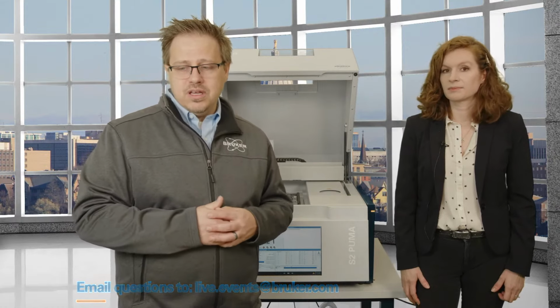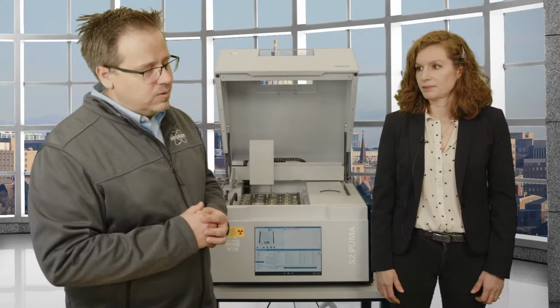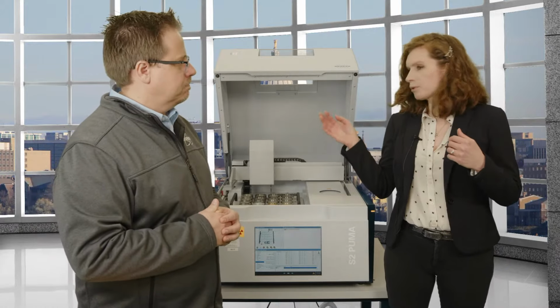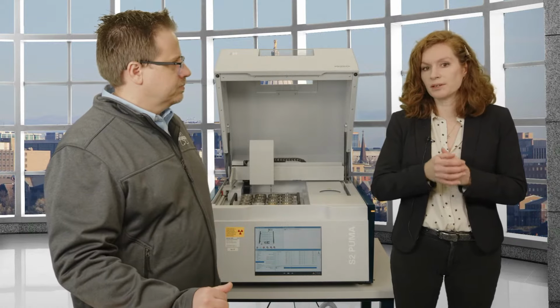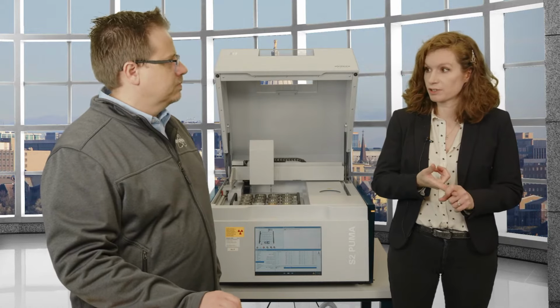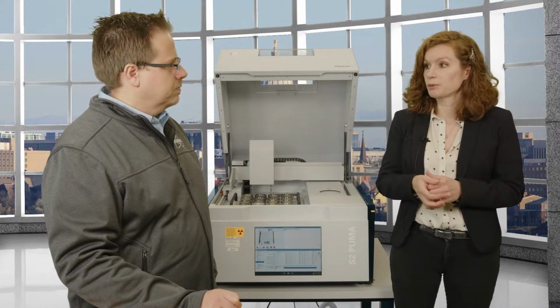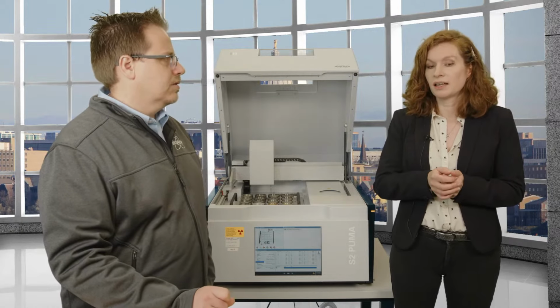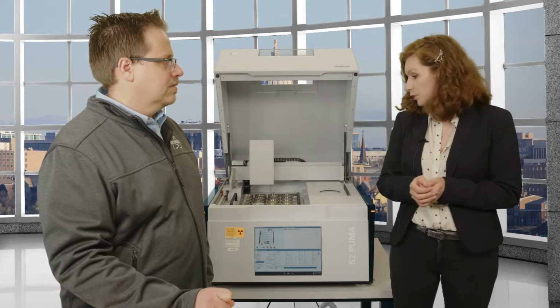The first question that has come in is from Mia: what is the elemental range? Particularly, what about light elements? The elemental range is sodium up to americium, or sodium up to uranium. For the light elements, I would always recommend going with the WD system because that's where you have higher power and can have the right crystals. You can go to fluorine, and you can even see carbon with this one. But as I said, if you want to quantify it, you have to have higher levels of it. You should definitely have your set of samples ready and do a proof of principle measurement with us, and we would love to support you with that.